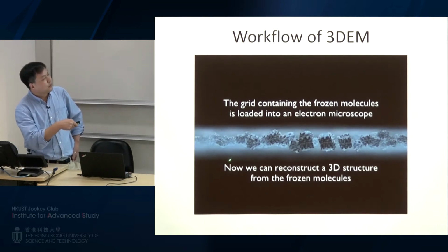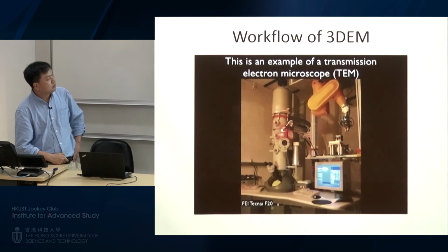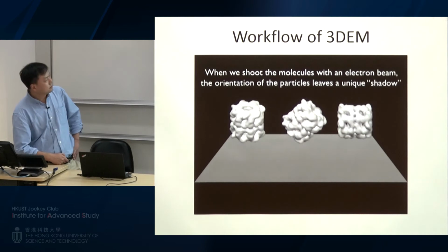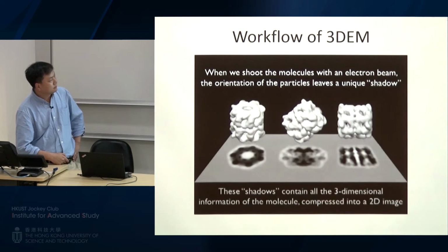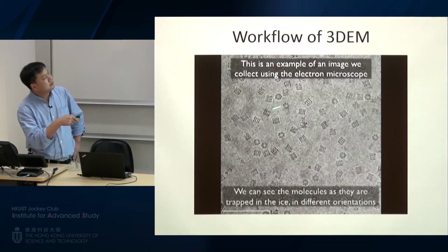Then we will take pictures of this ice-embedded sample. This is one of the typical Cryo-EM images we collected.